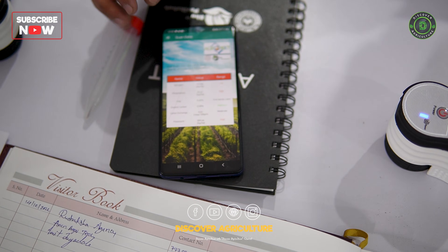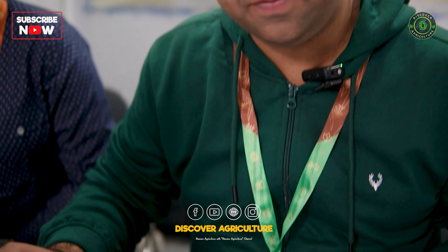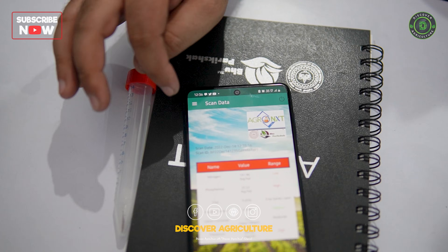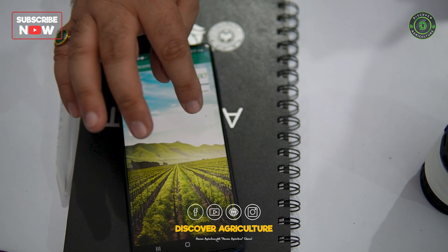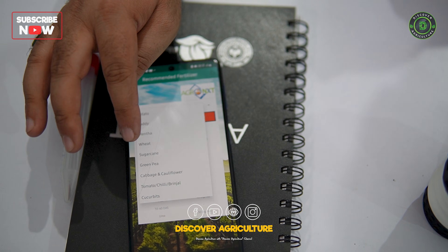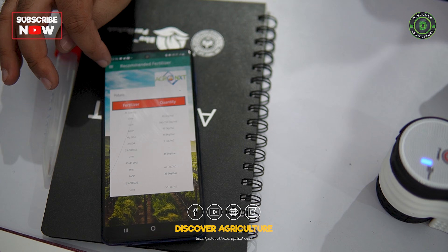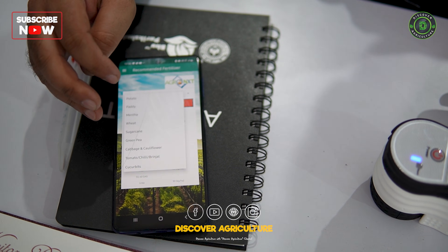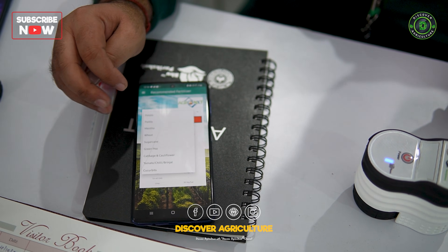Along with the instant soil diagnosis report, you will also find a tailor-made recommendation for the particular crop you want to sow on this soil. To access recommendations, click the top left corner of the mobile application, click on recommended fertilizer, and then select the crop. Based on the crop selected, you'll find tailor-made recommendations. We have mapped around 65 types of crops and based on customer requirements we can include the data for any particular crop.